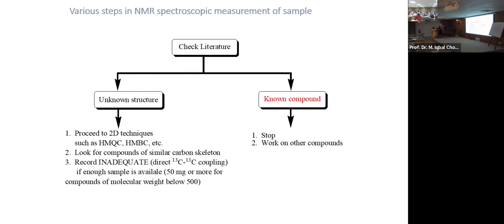Inverse NMR are the techniques in which we see carbon in the mirror of proton. So these are inverse. We are not directly recording proton like a proton NMR spectrum. We are not recording carbon like a C13 NMR spectrum. We are recording proton, but proton has the information of carbon. So we are seeing carbon in the mirror of proton. Okay, so that is the easier way to say it, but we will discuss the practical aspect, and the theory Dr. Iqbal will explain as inverse NMR.